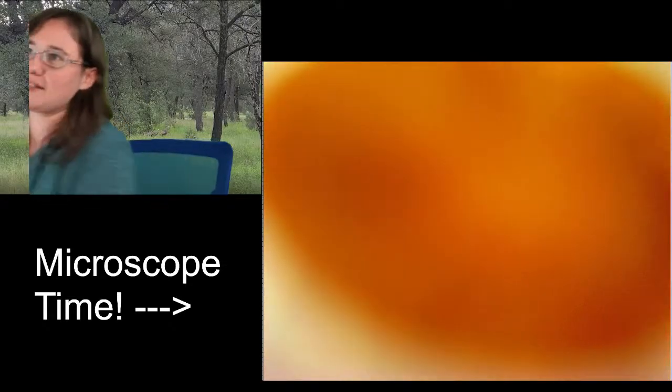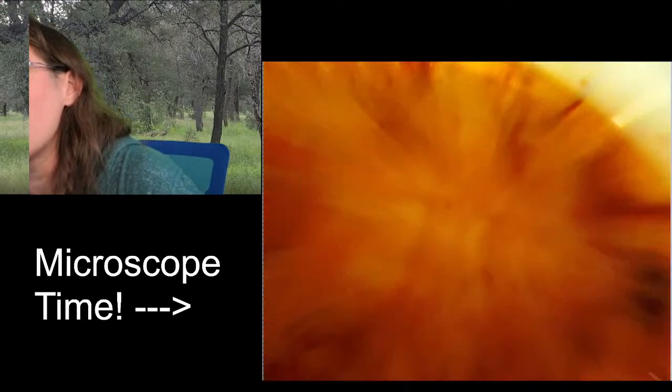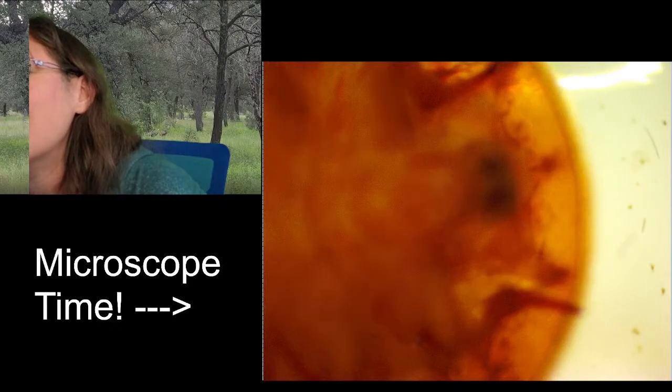Oh. All right, so I'm going to refocus my microscope down a little bit. It's got to be closer. Here we go. So if we look all the way up here, this is where the head is. And I don't know if I've ever actually zoomed in on the head of one of these guys. So I was curious because it almost looks like he's got a little funny face. Look at his face.